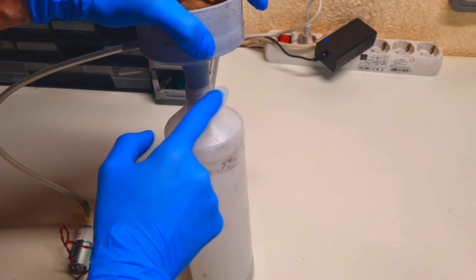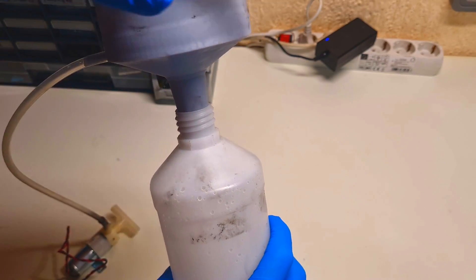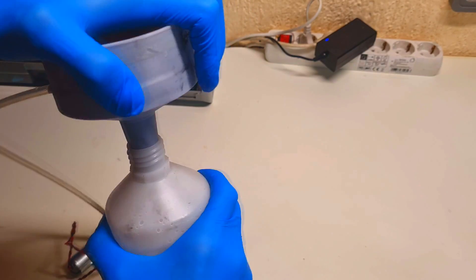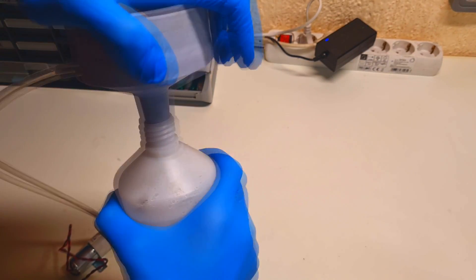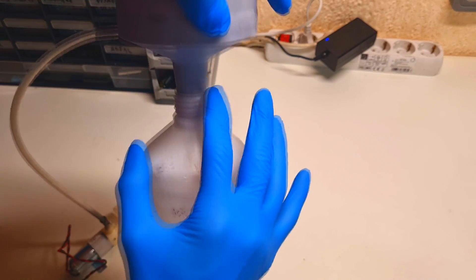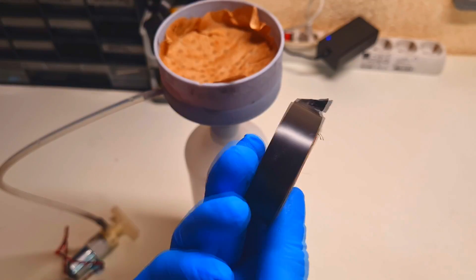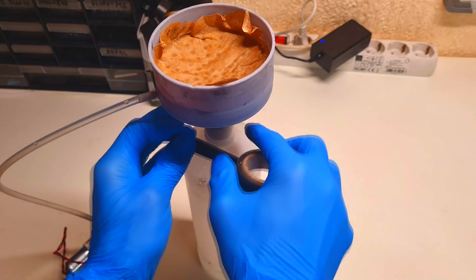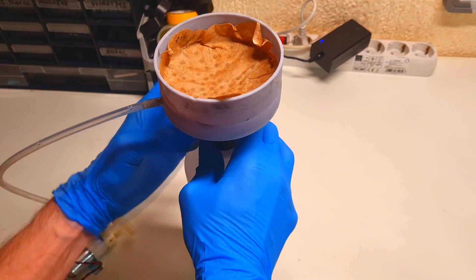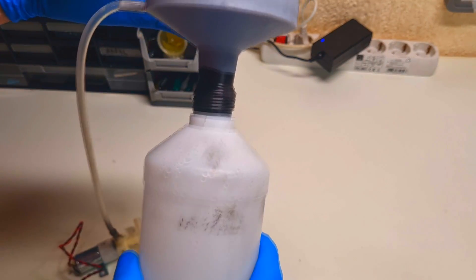In this area I need to make sure I get a really good seal, so I need to push the funnel a little bit into the container. But if you can't manage a good seal in this area, you can also use some electrical tape, like this for example.